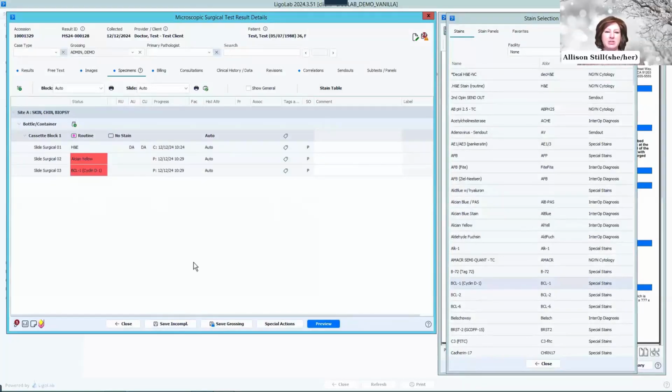That slide queue can be set to auto refresh. Again, for larger labs, it can be nice to set up a monitor in the lab that always views the slide queue and is set to auto refresh frequently. So all these additional orders will be viewed in a timely manner, and the lab can start working on them as soon as possible.